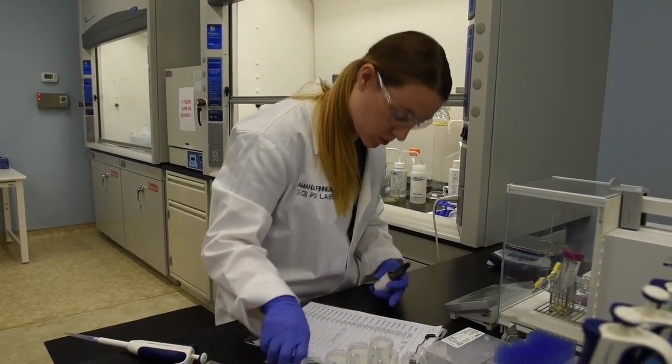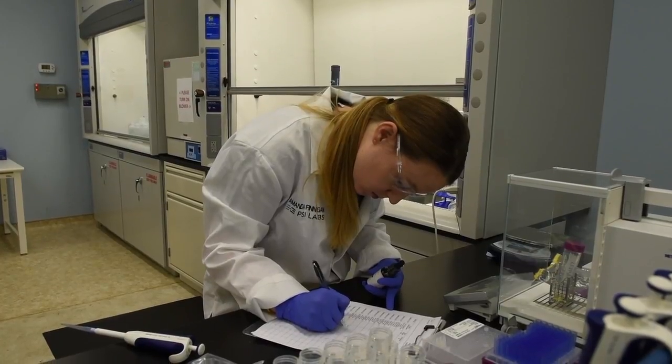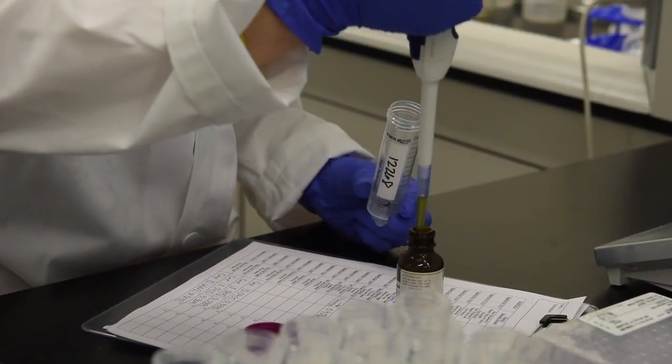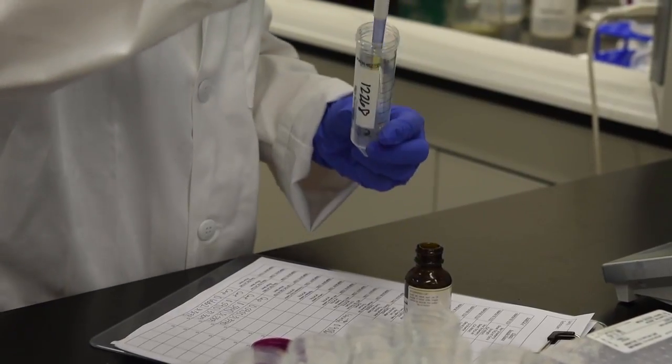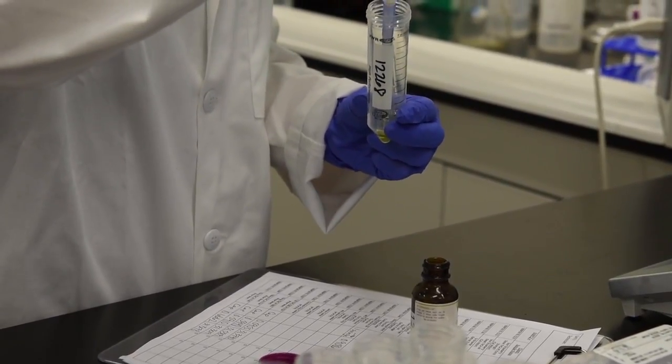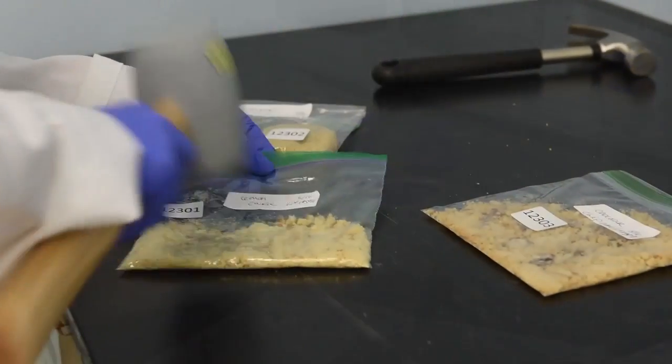This process involves what I like to call chemical accounting, where you're keeping track of every component of how much the edible weighed to begin with, making sure you get a homogeneous sample to subsample and get an accurate read on just how much is in there.